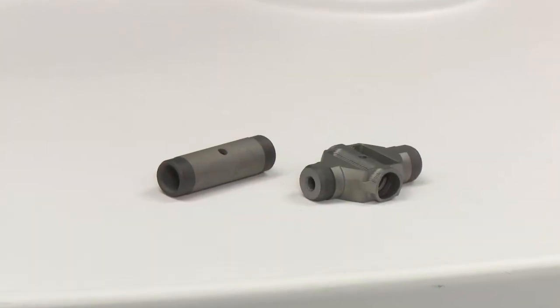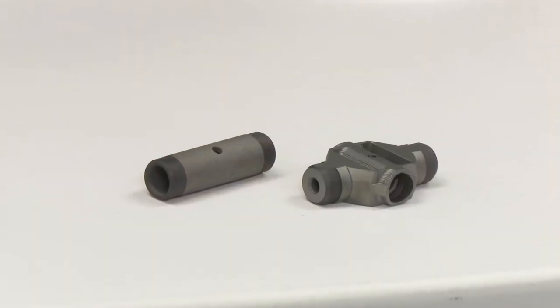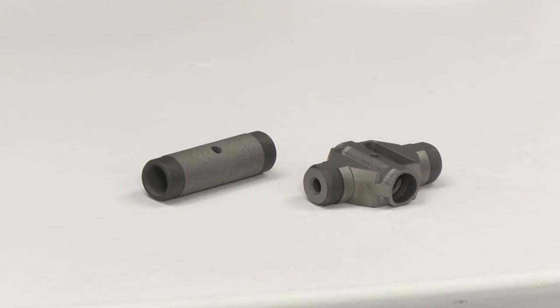At PerkinElmer we have two types of furnace systems. There is the HGA or heated graphite atomizer and the THGA or transversely heated graphite atomizer. For each system there is a different tube type, and they are available with and without end caps.